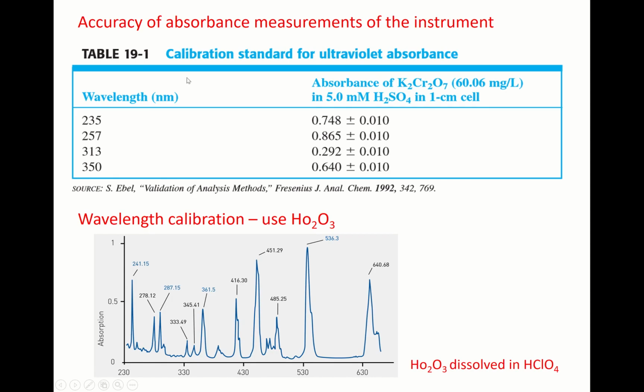Here, the accuracy of the absorbance measurement of the instrument. Now how do we know? How do we have confidence about the wavelengths measured by the instrument? In other words, how do we calibrate the instrument? Is there a good calibrant? Yes, there is.